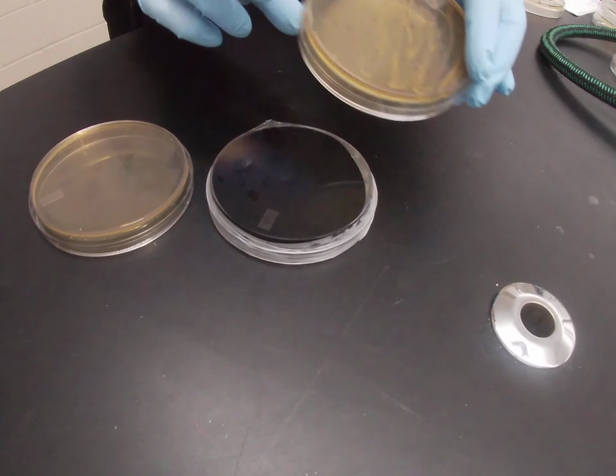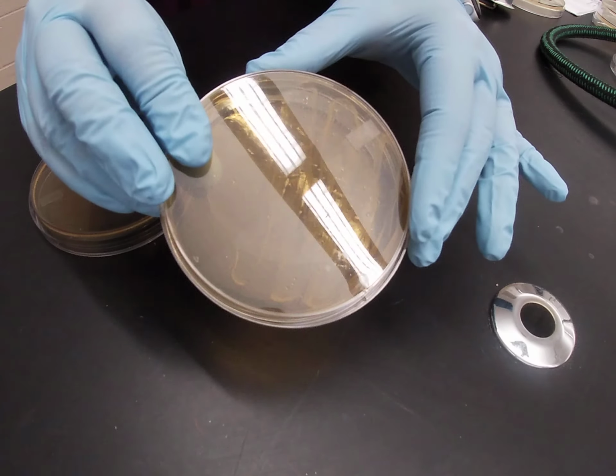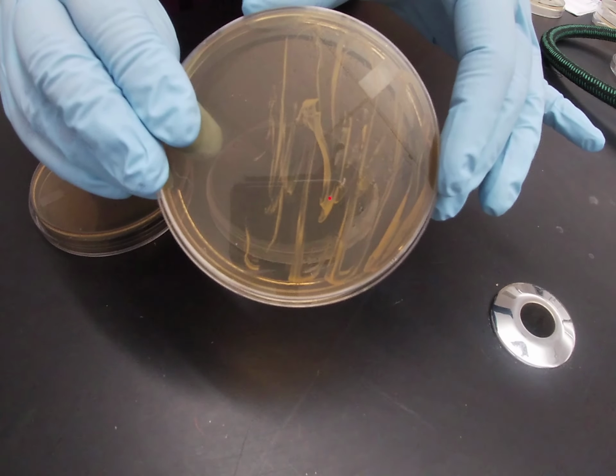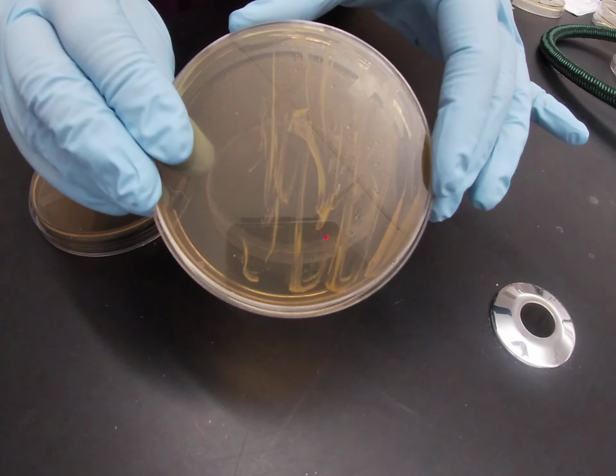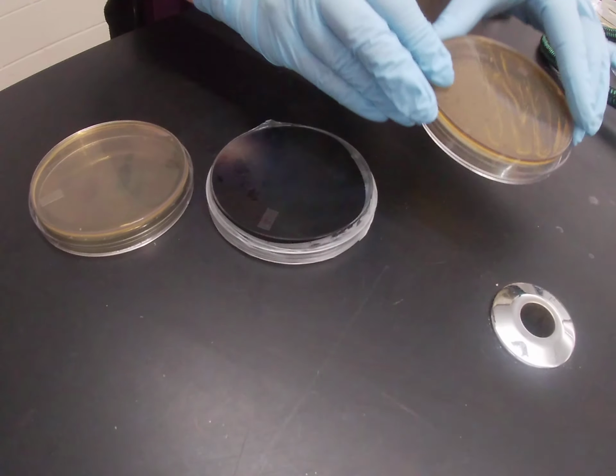Here you can see Staph aureus growing on the Bile Esculin agar. You can see that it's growing, but it is the color of the plate. So it's not inhibited. It is actually growing on the plate, but there is no breakdown of esculin, so you're not getting any kind of a color change.